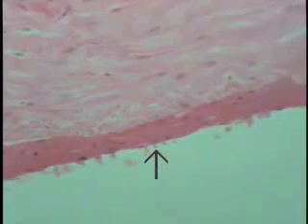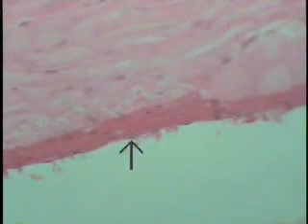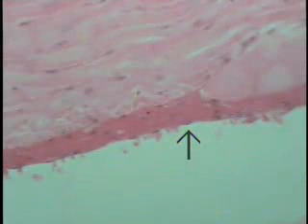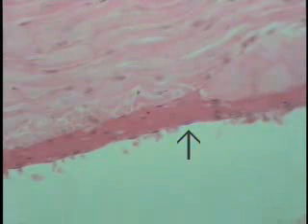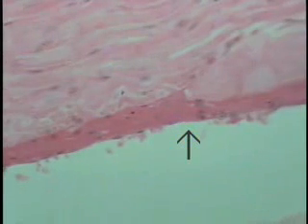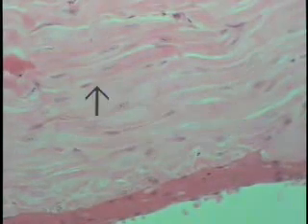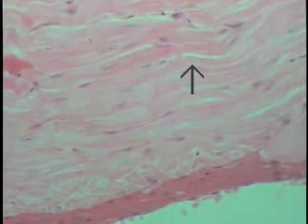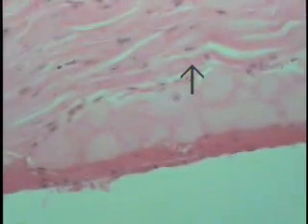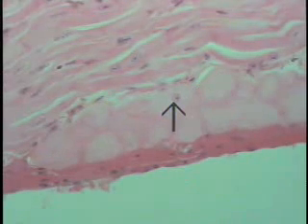By far the majority of the wall of the heart is made up of the myocardium. So these are endothelial cell nuclei, the cytoplasmic boundaries. One can examine at increased magnification in your own time. Now, these are longitudinal sections of ordinary cardiac muscle cells. As one can see, in this particular region, they're running lengthwise. And within the endocardium, this is where one should look. One should find these large vacuolated cells. A nuclear profile is showing in this one.